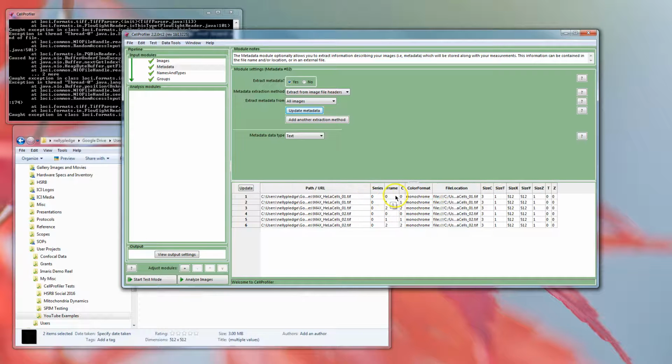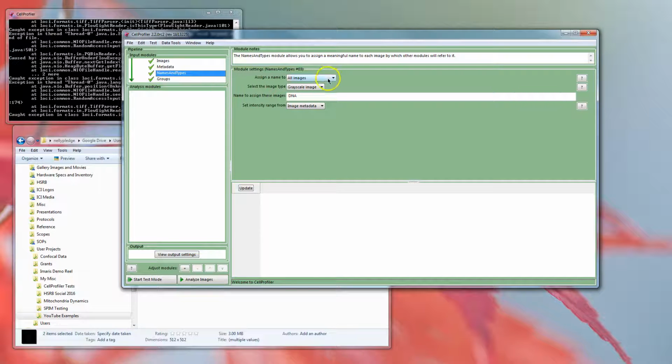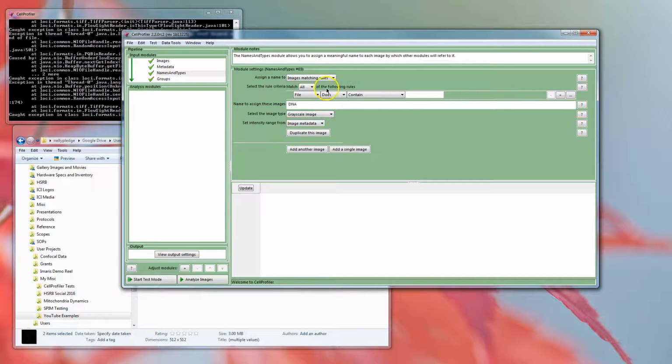And it's nice to see that you've got the files you bring in. For every file there should be an entry here for each channel or frame or Z, and then you have a long list if you have multiple Z stacks from different files in the list there. But it's nice to see they're all in place, and what we're going to do is pick them out based on some of this information here. So these different headers we're going to use in the next section. And so now, instead of just pulling every single image from that list, we're going to have a specific choice, and we're going to pull in the files.